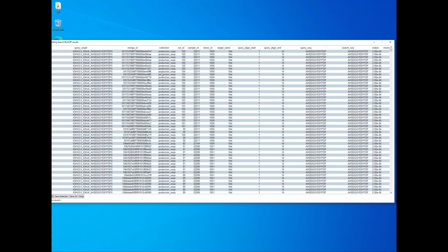Right now, all of your results are going to be coming from the same collection, but in the future, once we figure out the security procedures, you may also be able to search our paired sequencing, if you've been given permission, of course.